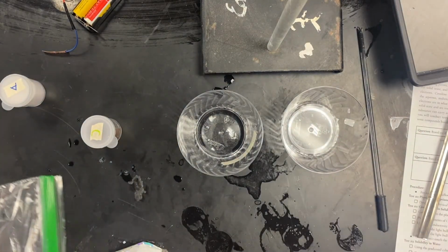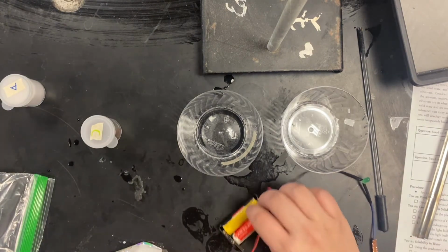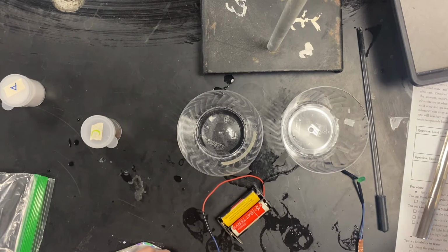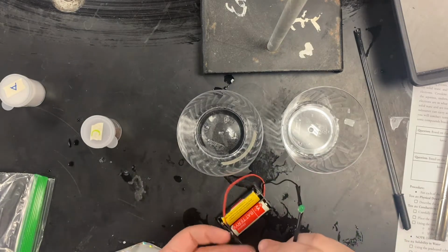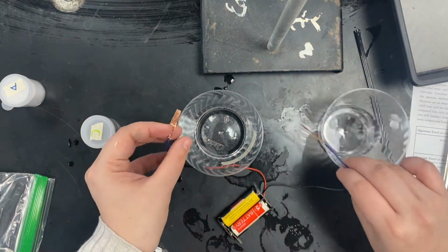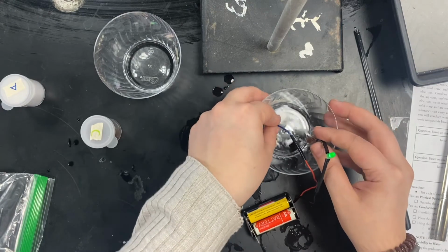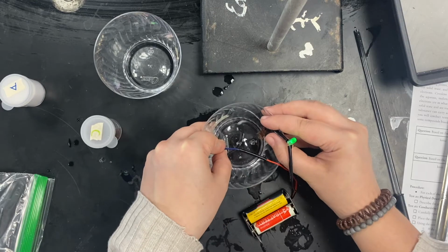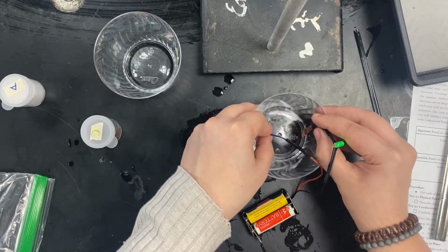To test the conductivity in the aqueous form, test number 4, we're going to go back to using our conductivity meter. We're only going to use this for substances that dissolved. So we're not going to use this for substance C because it did not dissolve. Again, make sure your meter is on. Let's do B first. Put both ends into the cup. Make sure the copper ends are far away from each other. And look at the brightness of the bulb. So here we have a kind of dim bulb.